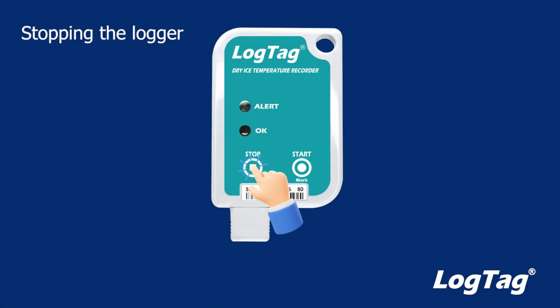Press the stop button to begin the stop sequence. The LEDs will flash green and red together for 4 seconds. Release the button to finalize the stop.